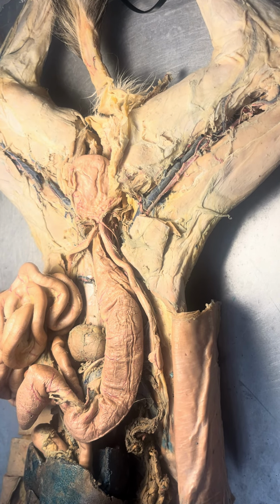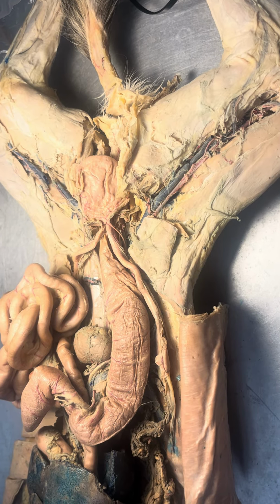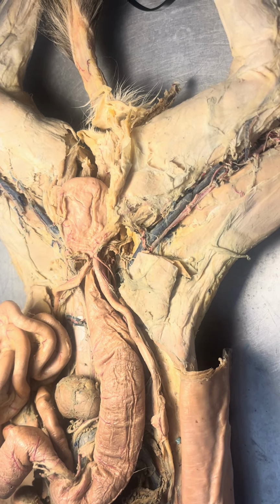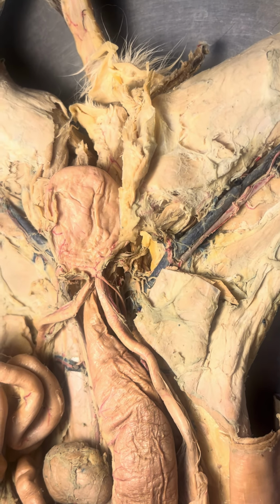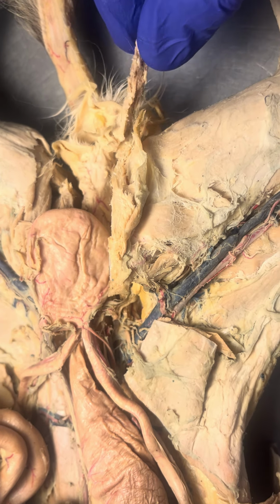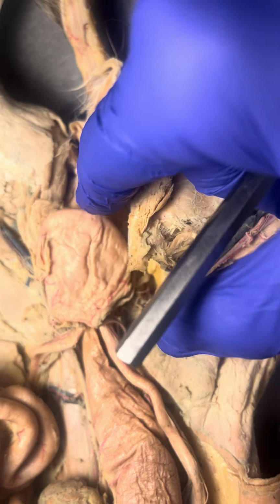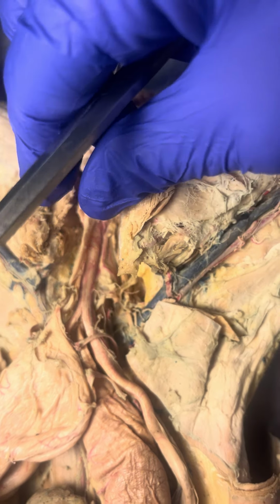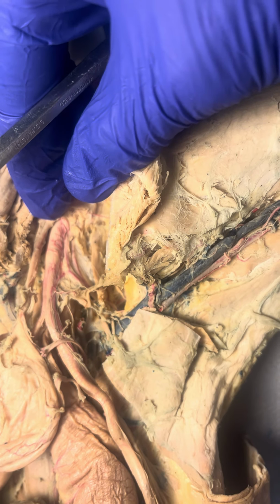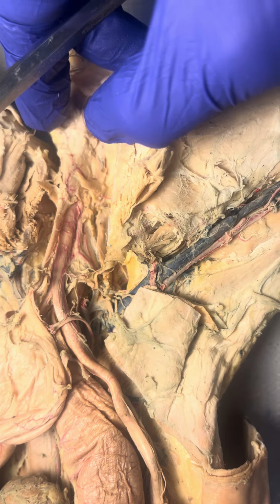Here we have a dissection of the female cat reproductive system. And I might be unsure at first if this is a male or a female, so I take a closer look. I might think that this is a penis, and I'm not quite sure, so I look for the 3-tube structure, and I can see it right away. I see the 3 tubes here, and I know then that this is a female.